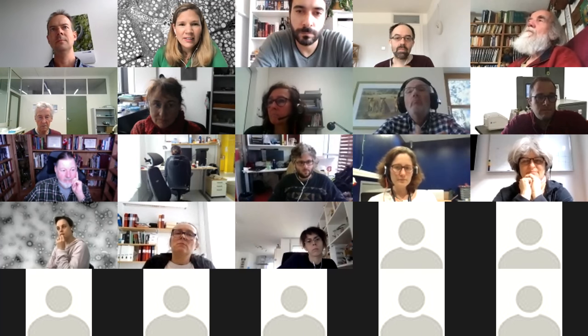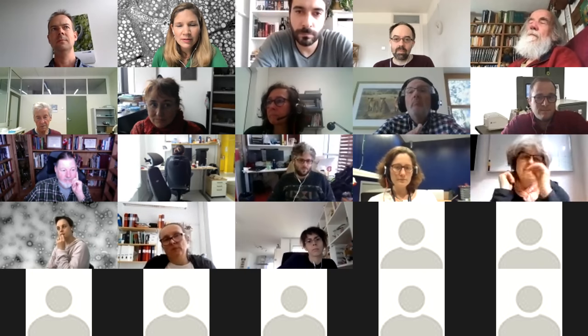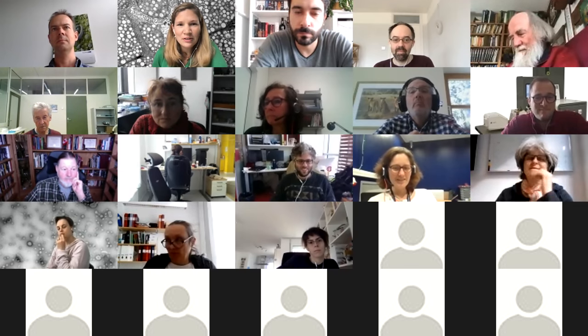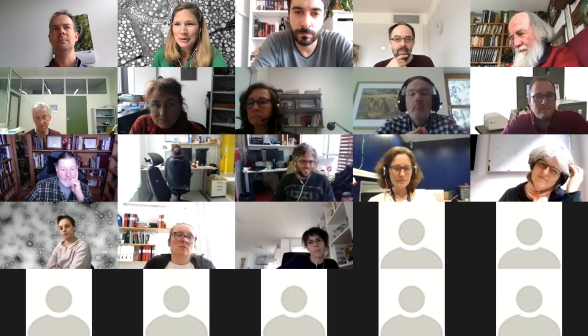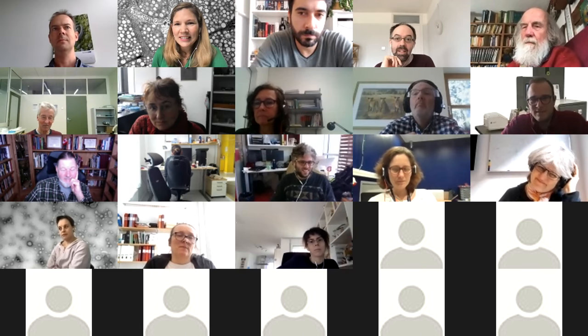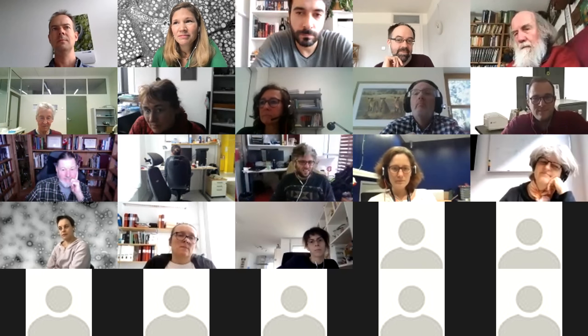So I guess it would be interesting to know if there's anyone in this group who has this horrible side effect, it might be interesting just to see what this one's like. But thankfully, I think we've all used gloves enough that none of us have this nowadays, which is a good thing. Matt, you're unmuted again. I'm just chipping in again. Personally, I use gloves when I'm handling blocks anyway, because I don't want to get my greasy fingers on it and interfere with the sectioning.